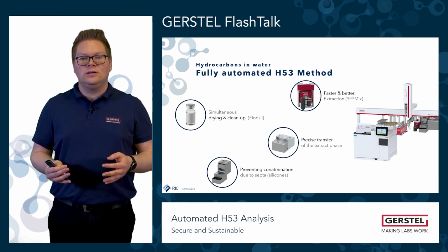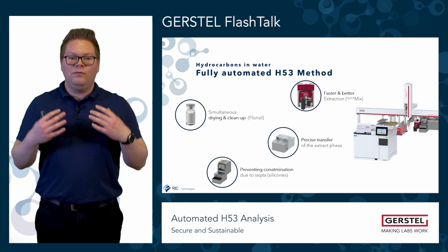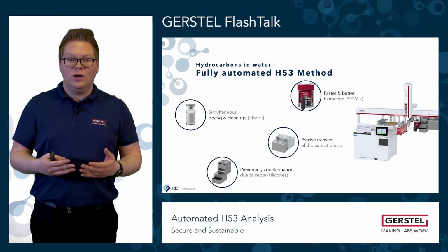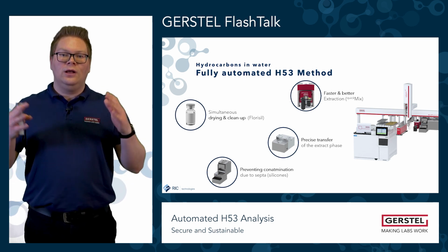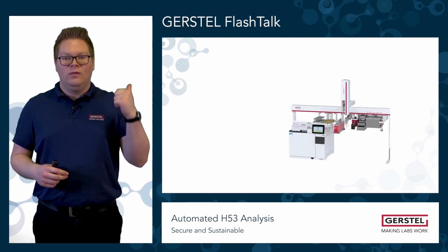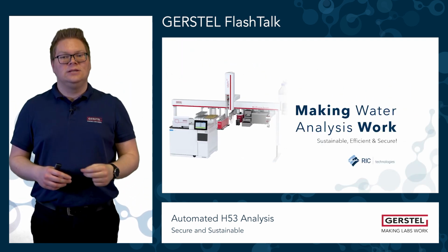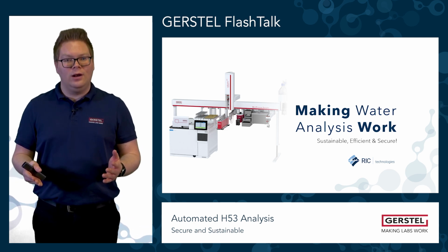Last but not least, by using our decapper and recapper system, we are preventing contamination of our extract phase with siloxanes, due to avoiding piercing the septa during liquid-liquid extraction and cleanup. Sustainable, efficient, and safe. This is the automated H53 method. Making water analysis work.